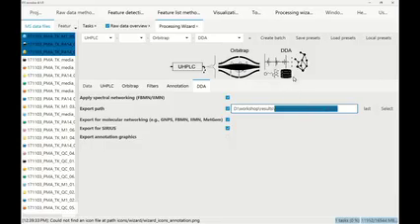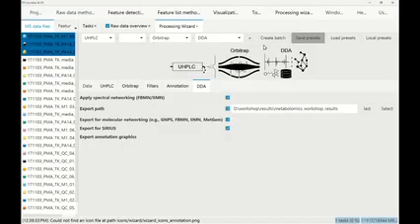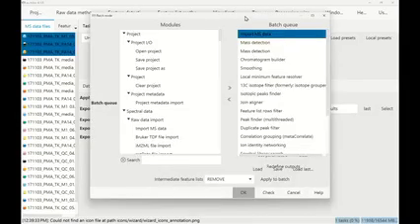name without any extension. And then, if you have this preset, we could now just say save, and we can save this wizard preset. This is quite nice, and you can even save, for example, just the sample introduction. So we could save this UHPLC reversed phase 10-minute gradient. We could save it, and then later we can just easily retrieve just the parameters for the UHPLC and plug them together with a different mass spectrometer. And when we want to process now, we click on Create Batch.